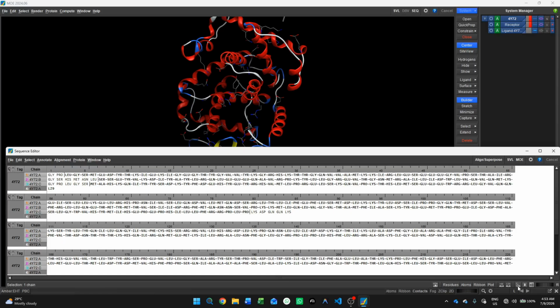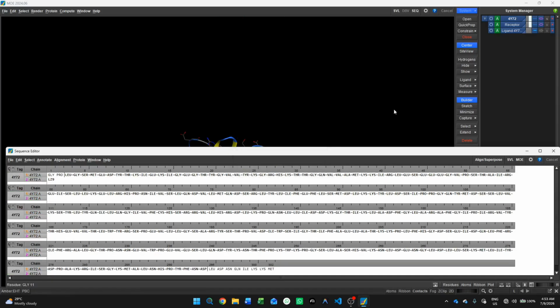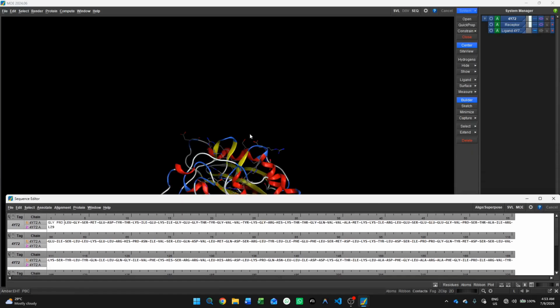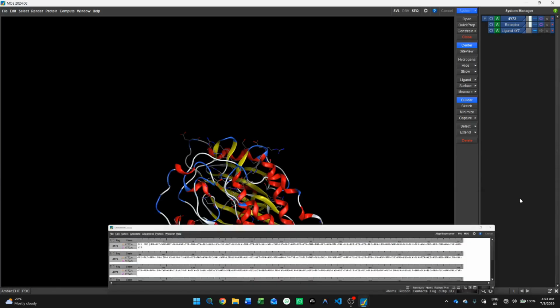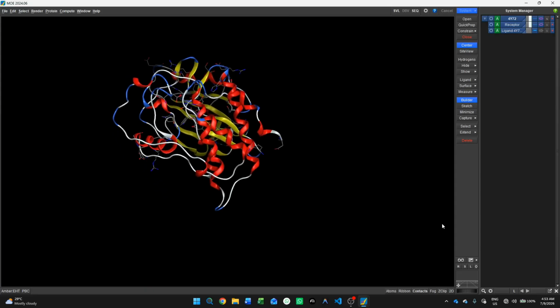So I don't think I'm going to need chain B and chain C, since where my active site will be is already on chain A. So I delete those other two chains. Good. So I have, let me reduce this, take this up. Good.